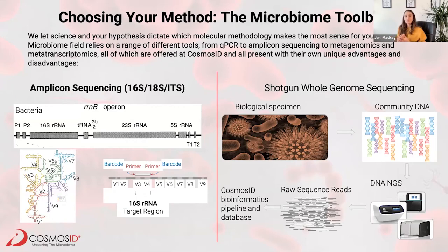I'm sure the group here will be more than familiar with all of these, but typically for metagenomic studies, you're looking at either amplicon sequencing or whole genome. Now, with amplicon, you're of course only looking at one specific gene or even specific hypervariable regions from one gene that are then taxonomically informative. Shotgun metagenomics, on the other side, is a whole genome approach. So you sequence all of the DNA, host and microbial, and then following this, you bioinformatically sort of tease apart the sample. Now, with both of these approaches, you would often refer to reference databases as part of your analyses.